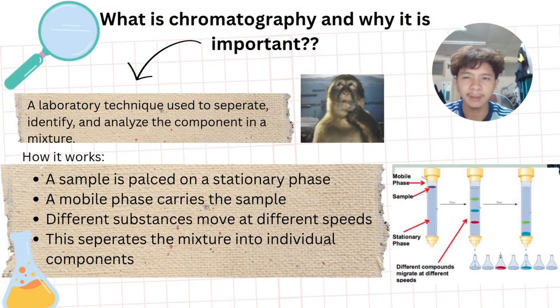So, what is chromatography? As we mentioned earlier, chromatography is a technique used to separate, identify, and analyze the components of a mixture. How does it work?